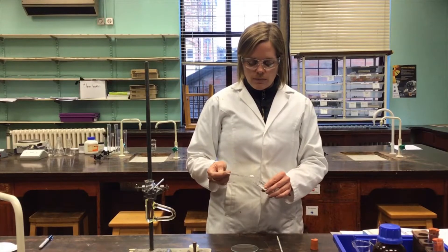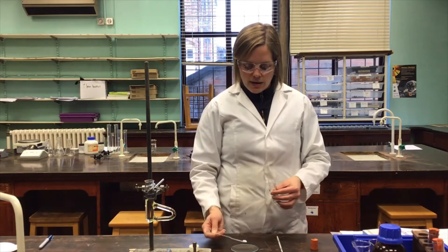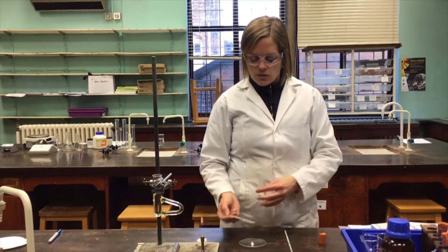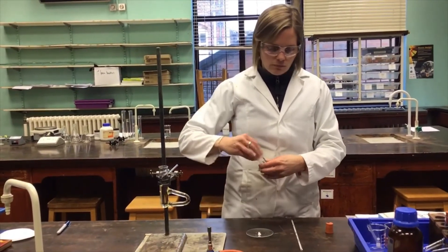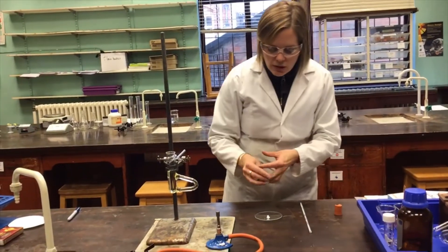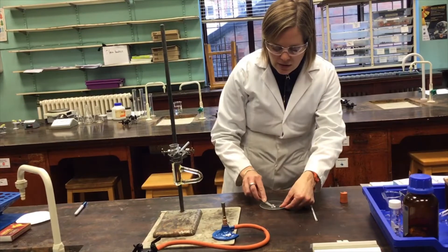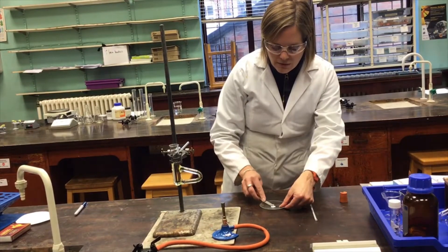To measure the melting point of the aspirin that we made, I'd like to put a little sample of that aspirin onto a watch glass like so. I'm just going to use the edge of the spatula to make sure that it's nice and powdered down so that there are no big lumps of aspirin.